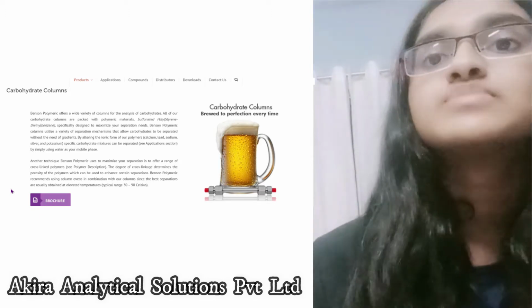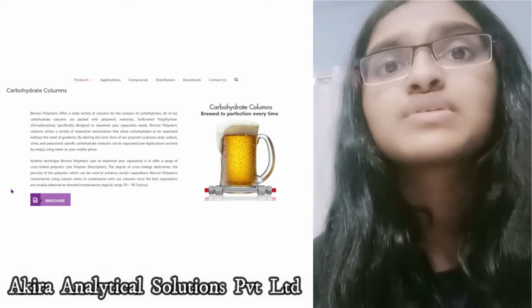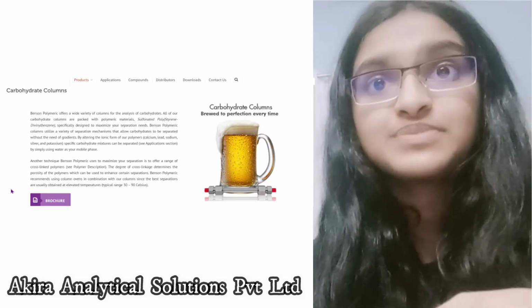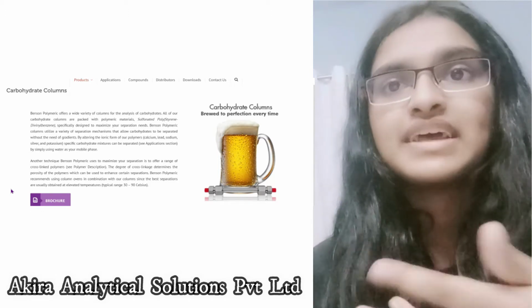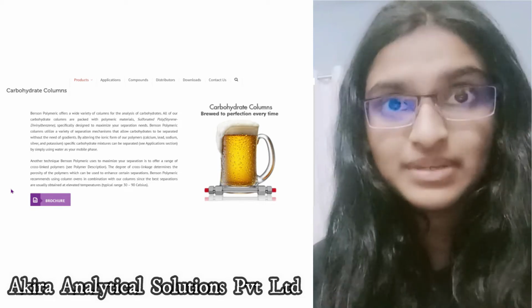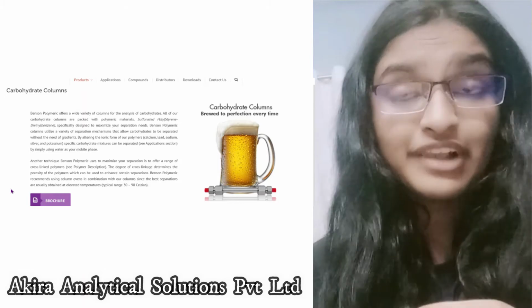By altering the ionic form of their polymers, the calcium, lead, sodium, silver and potassium, specific carbohydrate mixtures can be separated by simply using water as your mobile phase.